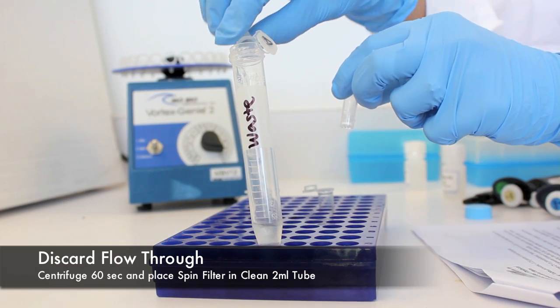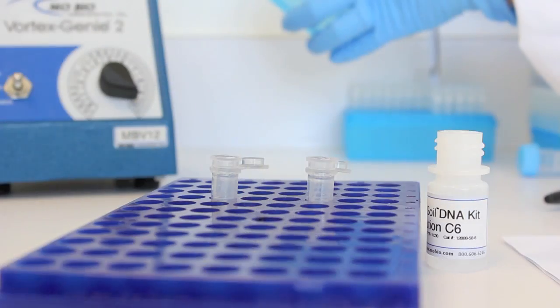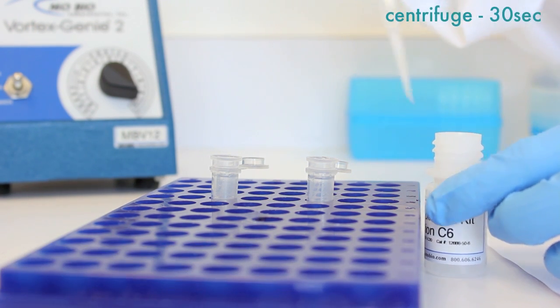Discard the flow-through. Centrifuge to remove residual C5, and place the spin filter in a clean 2 milliliter collection tube. Add 100 microliters of solution C6 to the center of the white filter membrane and centrifuge to elute the DNA.